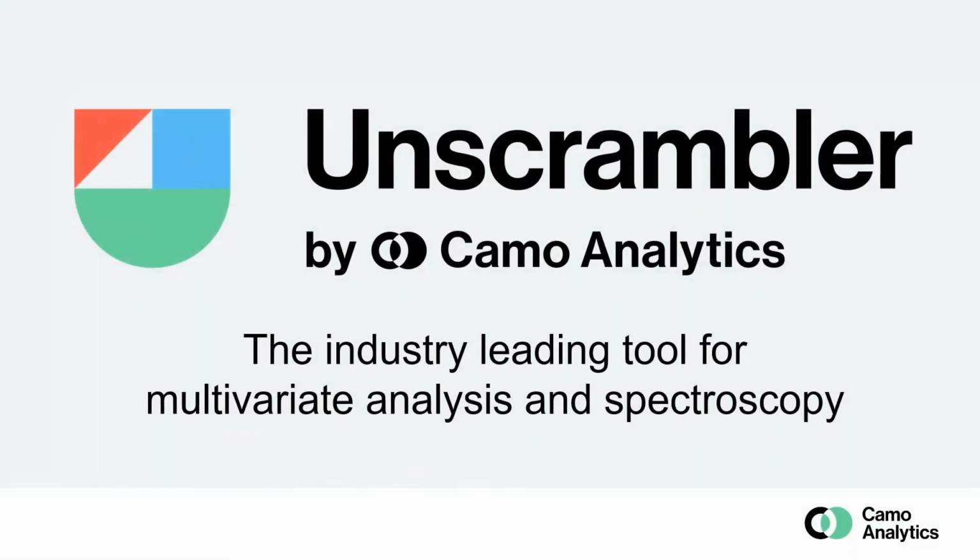Let me give you a very brief introduction to what Unscrambler as a product is and who it's meant for. It's a science-based software, developed for domain experts to be able to do explorative analysis using their own data. It's been around since 1984.